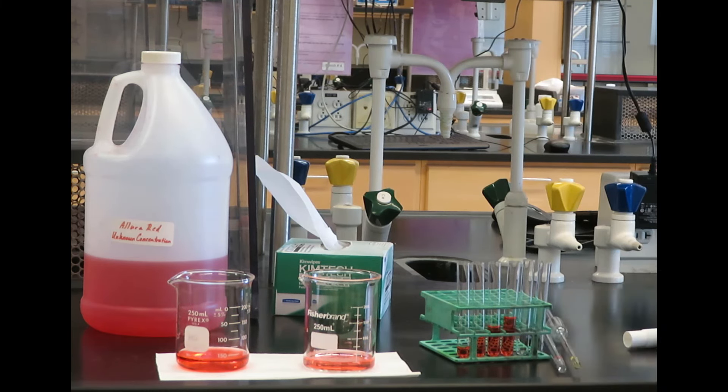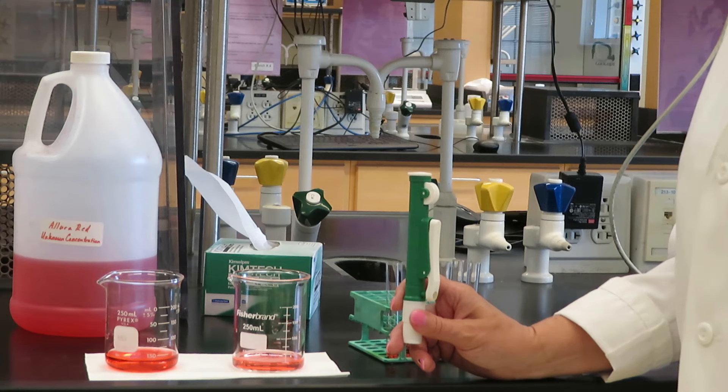When you leave stock solution in the pipette, often the water dries out, leaving crystals. And that means the pipette needs to undergo rigorous cleaning before its next use. We hope you enjoy your labs using our new syringe pump fillers.